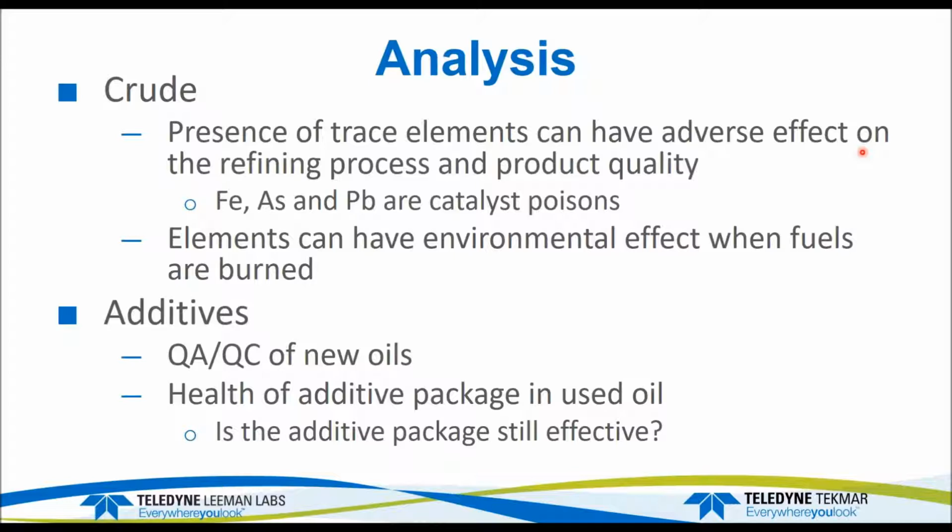When we look at additives, we may be looking at the QA and QC of new oils to make sure a particular product is still within specification, or in condition monitoring or wear metals analysis, it can give an indication of the health of the additive package in a particular oil. Is the additive package still effective? So those are some of the reasons for this analysis.